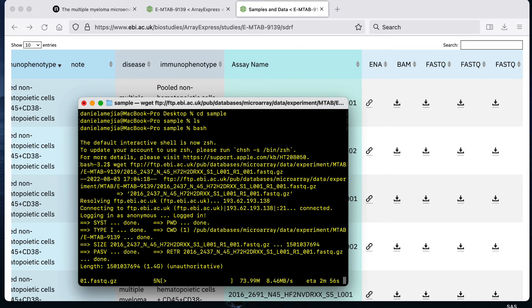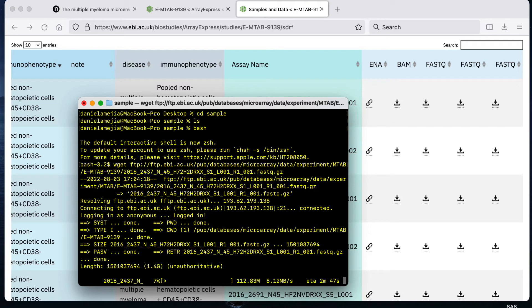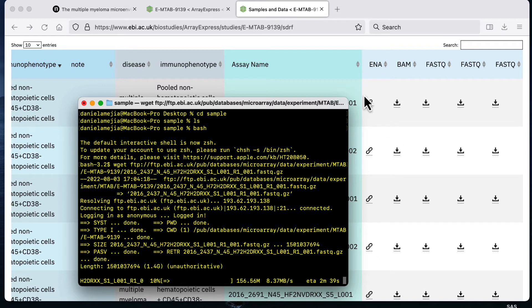That is the only command that you have to do and now that file from the internet is being remotely downloaded to my folder and it says it's going to take about three minutes to download. This file is about 1.5 gigabytes large.